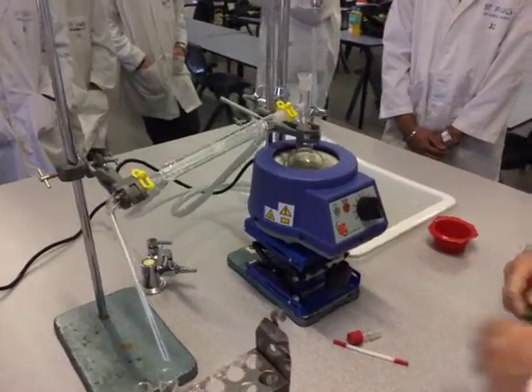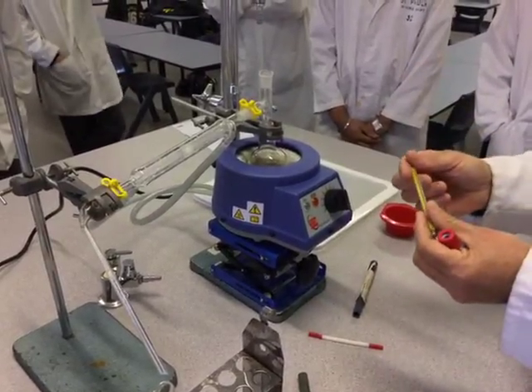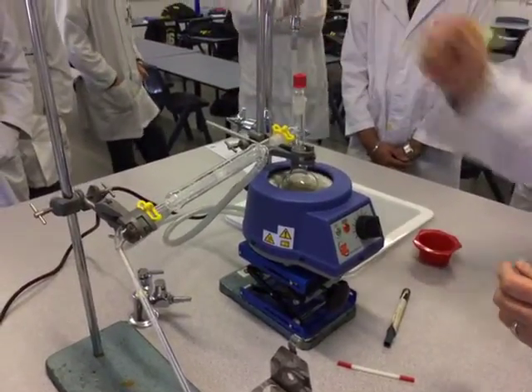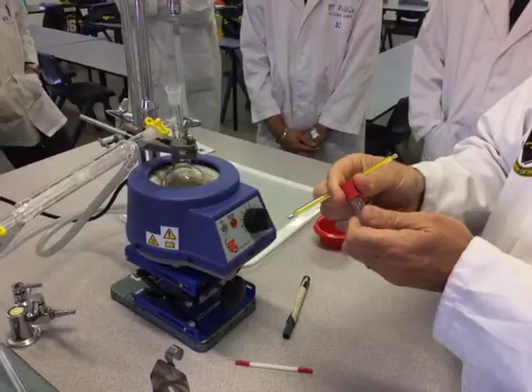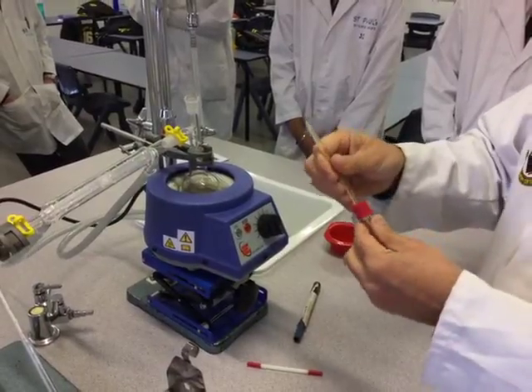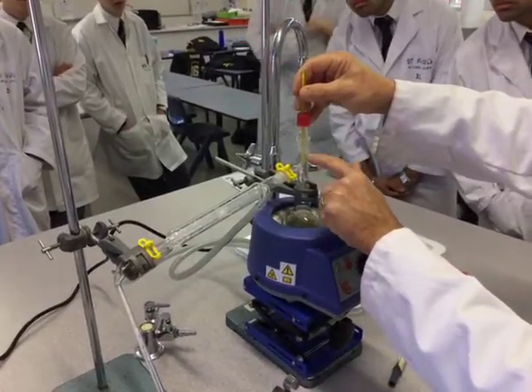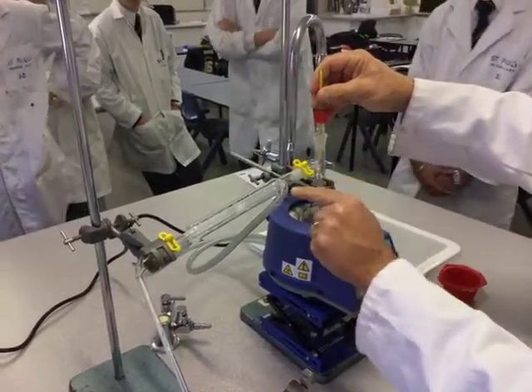Next thing we have to do is get our thermometer ready. Remember these are mercury thermometers and they go to 300, 360, so you've got to be careful with these — we don't want these dropped on the bench at all. This is the adapter we use for the thermometer, and as I said previously it's got a silicon o-ring. You loosen off the o-ring, jam the thermometer down when you've loosened it off enough, and that sits in the stillhead. We want to make sure it's right in line with the T-piece — we don't want it too high or we're going to miss the actual temperature — pretty much level with where the vapour is going to enter the condenser.